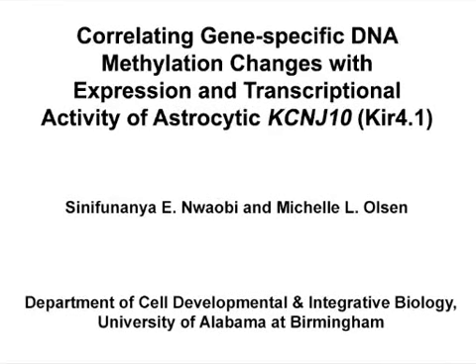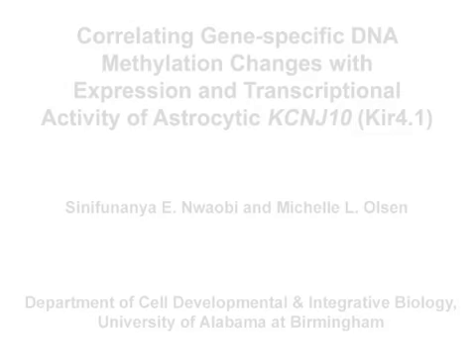The overall goal of this procedure is to assess the DNA methylation status of KCNJ10 in an enriched population of astrocytes and correlate DNA methylation changes of the promoter with transcriptional activity. This is accomplished by first isolating an enriched population of cortical astrocytes from whole rodent brain via FACS sorting.